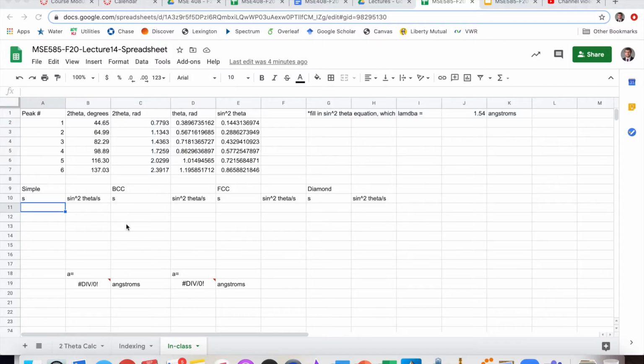So I'm going to take these values and transpose them into the spreadsheet. We're back, and I showed you how to get the S values for different parts. So in the procedure, I told you that we have to assume a structure. Well, if we're building a spreadsheet, we can simply put out the values for all four of the structures. So that's what we're going to do here.